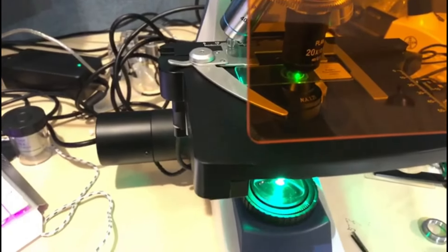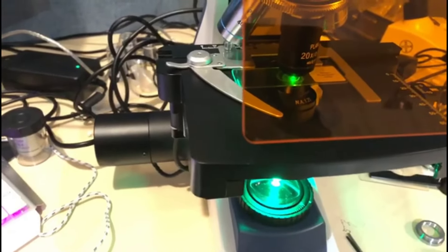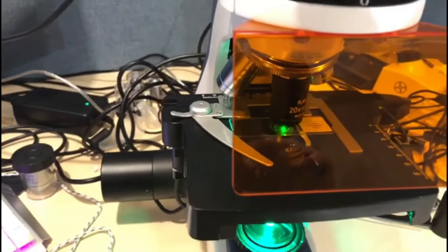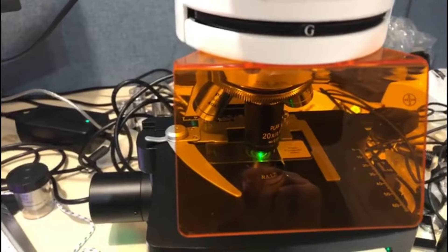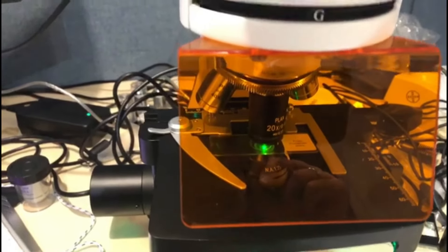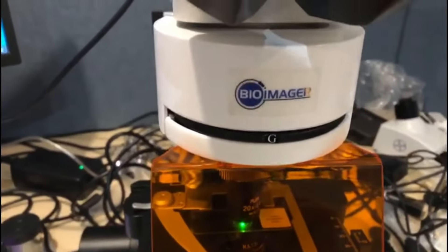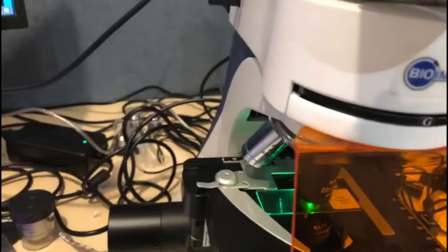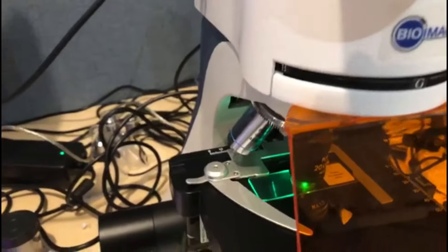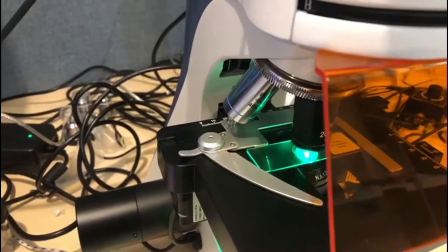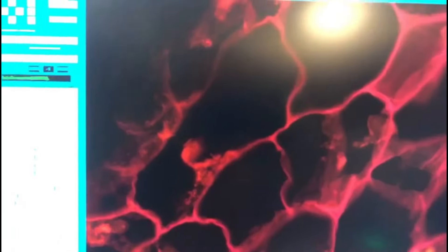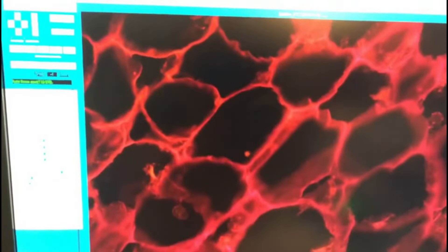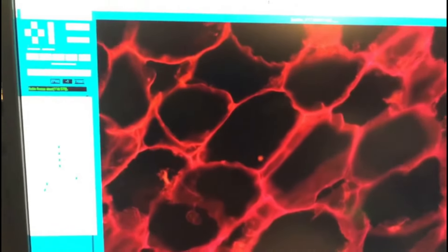Here is one example of fluorescence slide imaging. In this case we are using a potato fluorescent slide. We are using a 20x objective lens and collecting green color — we excite the green color and the emission is red. In the monitor we have live imaging of the sample.